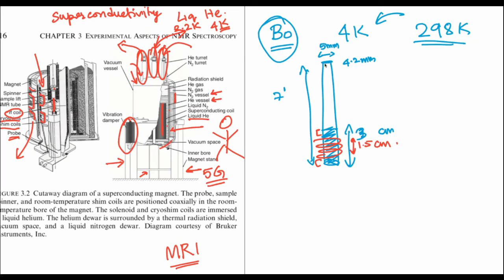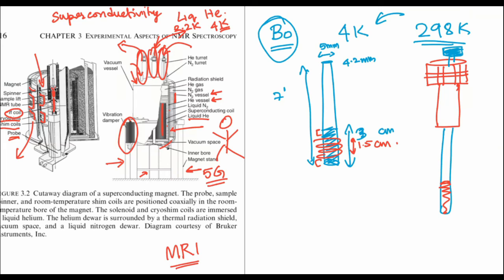And in addition, this NMR tube is not dropped in as it is. You also have something called a spinner. You can imagine that's the spinner, and your NMR tube will look like this. This is where your sample is, and this is called a spinner. The spinner will have different colors, either this way or this way, and this is where you put the sample in, and you are able to see the spinner depicted here.